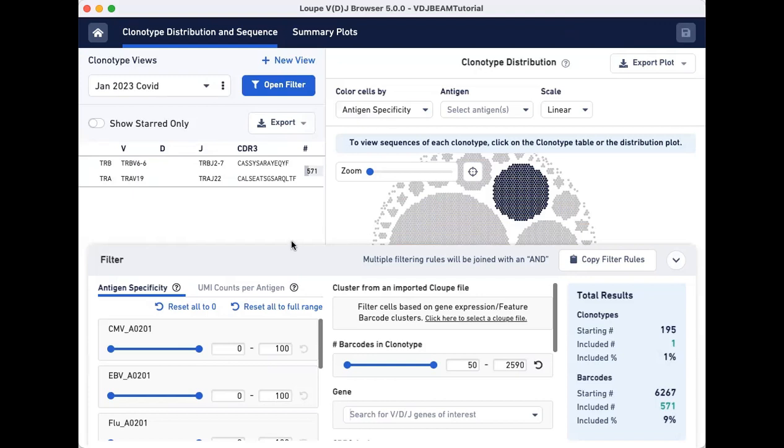As demonstrated in this video, with Loupe VDJ Browser, you can easily find clonotypes that associate with your antigen of interest without writing any complicated code or having to ask for help from a bioinformatician.